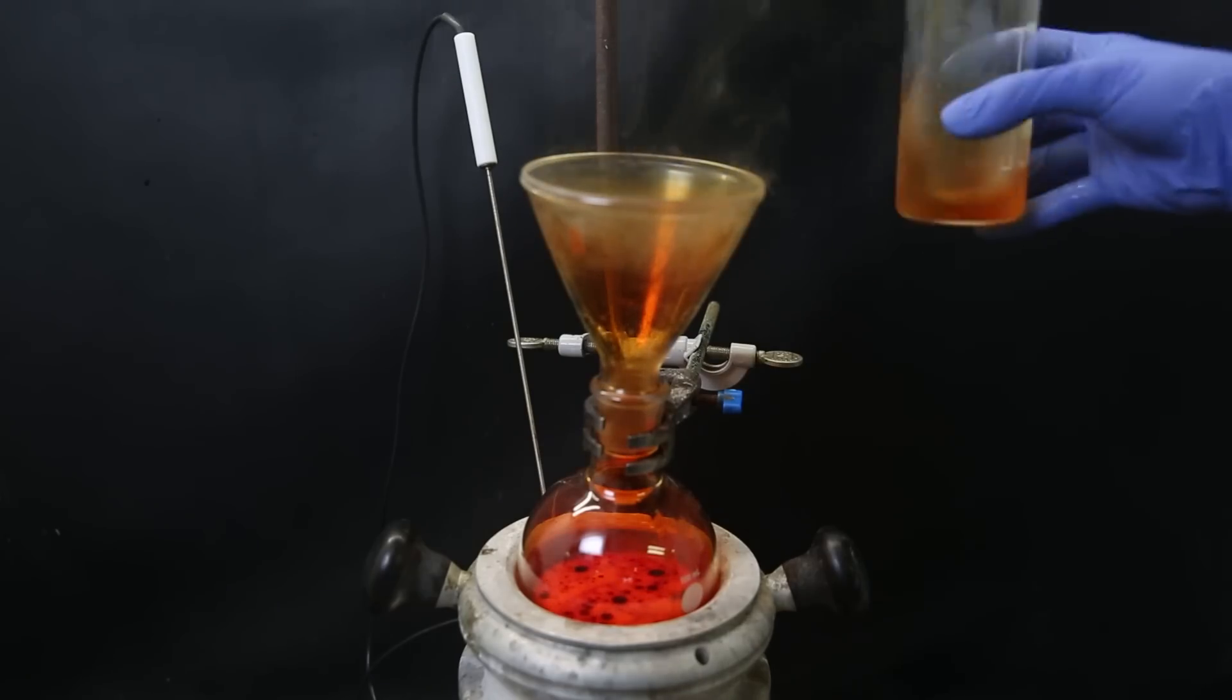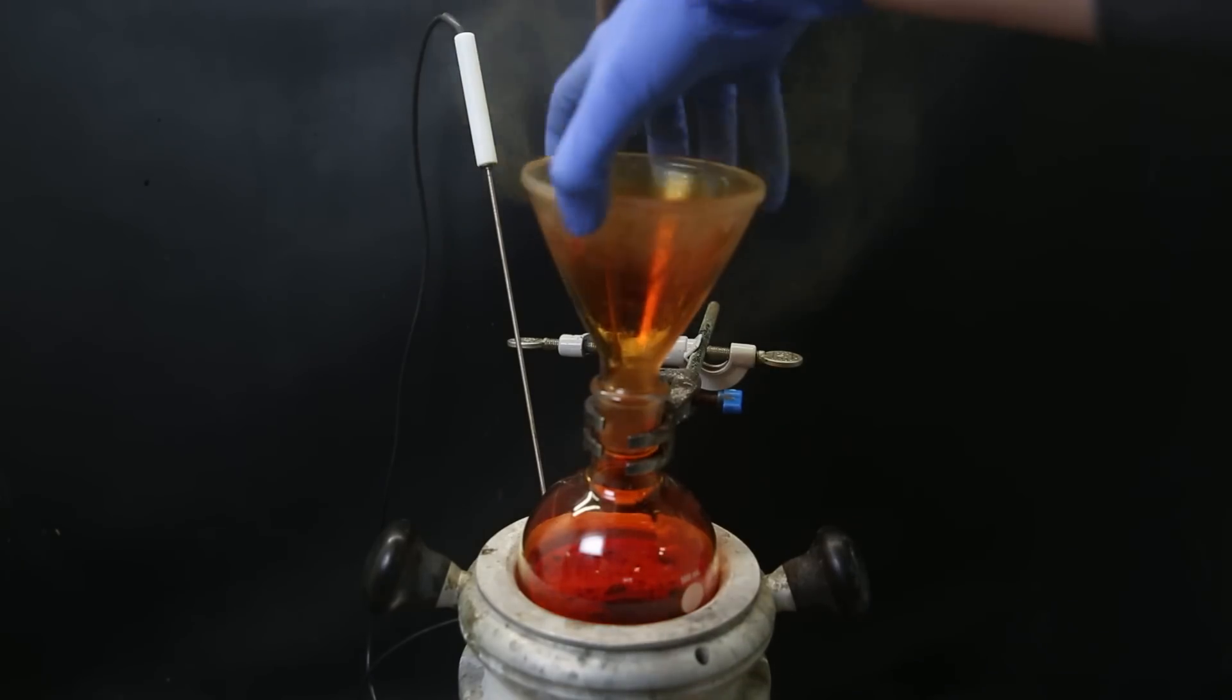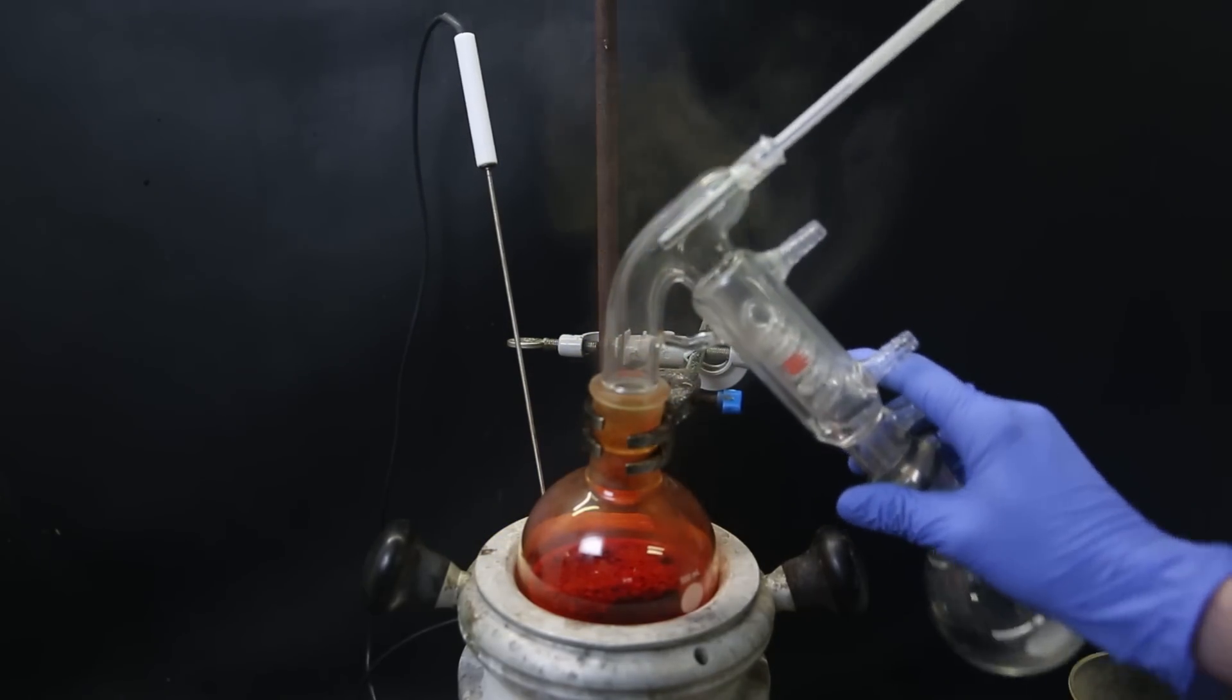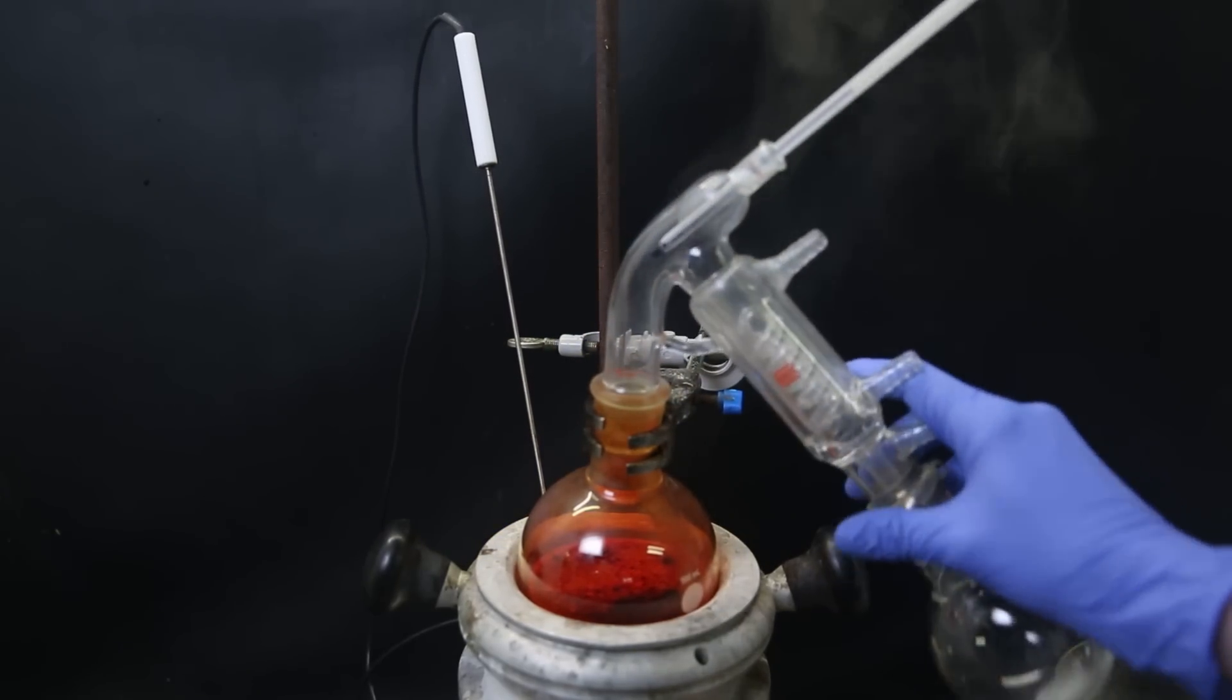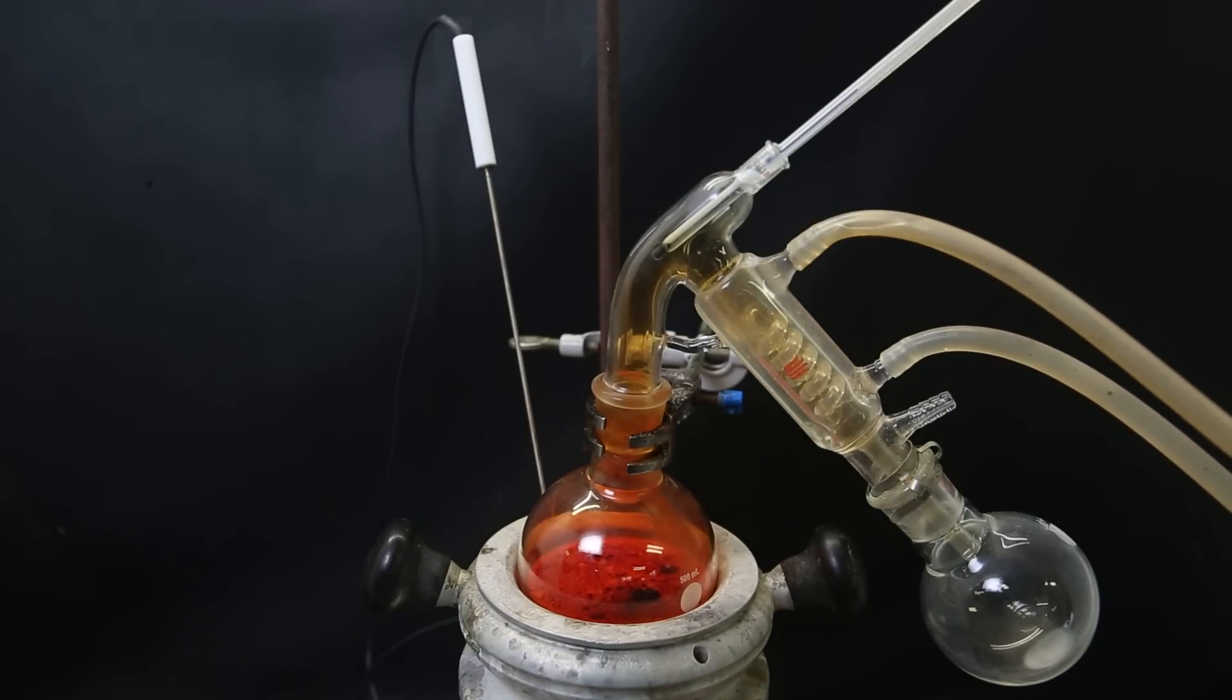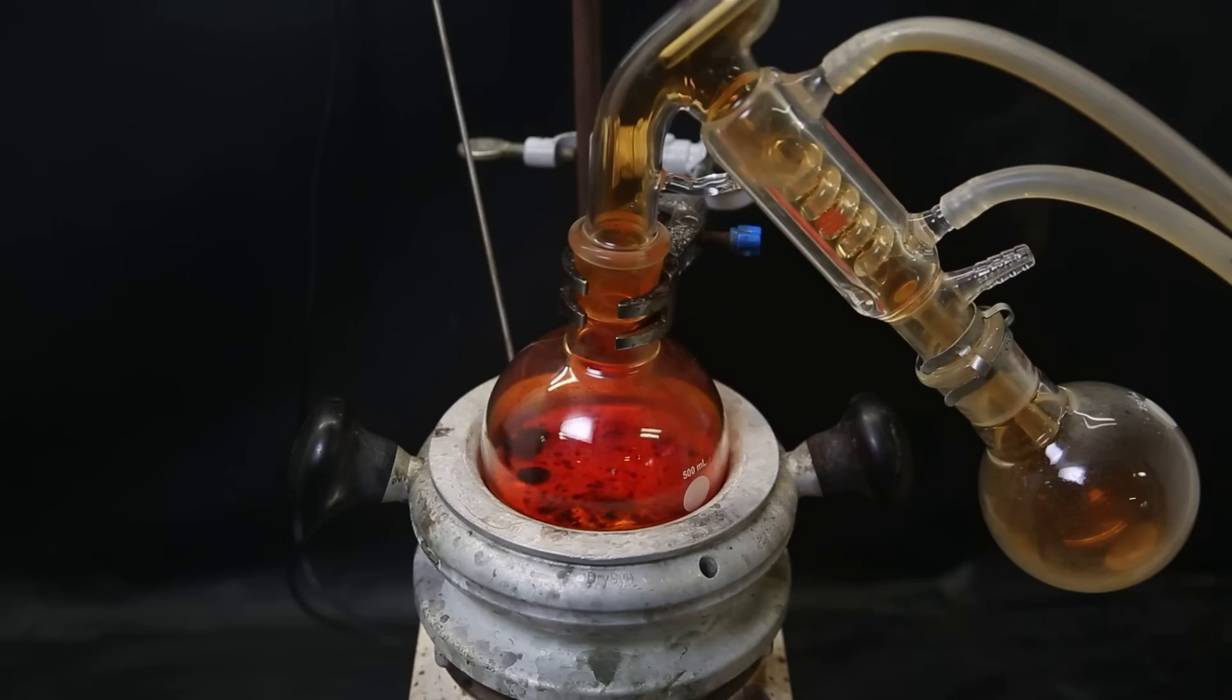I add more sulfuric acid, and then quickly attach a short path distillation apparatus. And then start heating it to a boil, to increase the reaction rate, and make the chromyl chloride distill over. After a short while, the stir bar starts to come loose, and it begins to mix normally.